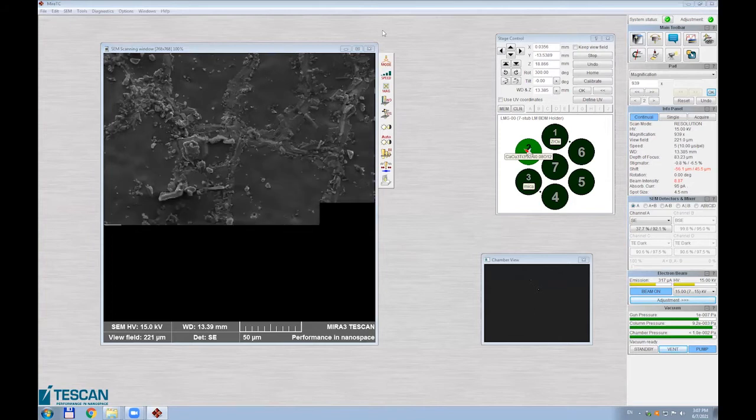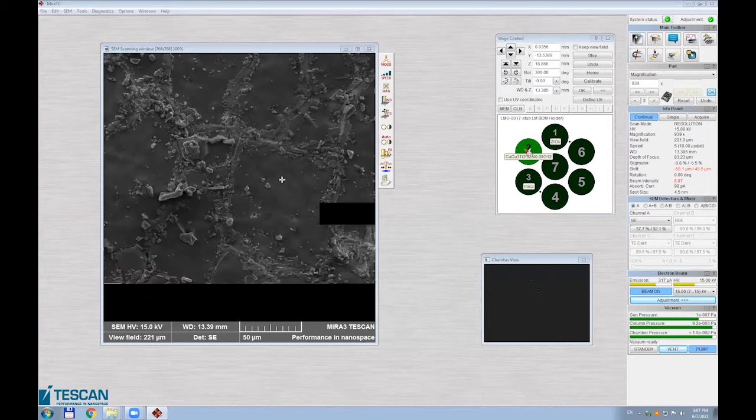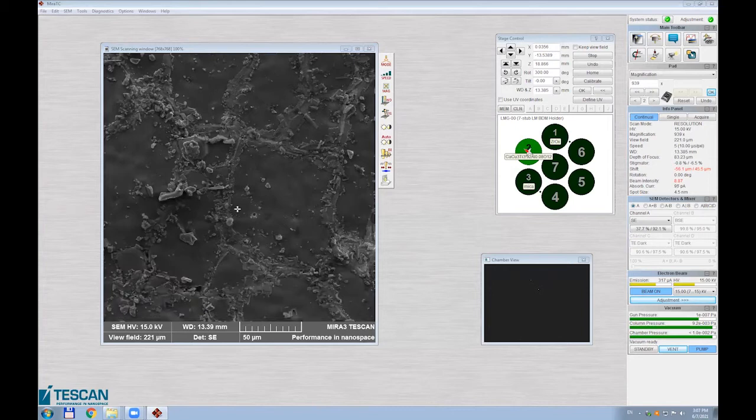Yep. Okay. So now, here is your sample. And as I said, if you have no clue what's in there, you can scan it in a minute. When I put acquire here, you have a spectrum. Probably I have to remove everything, so that you can see how fast it is. Okay, so you have a spectrum, so we can stop it for now.